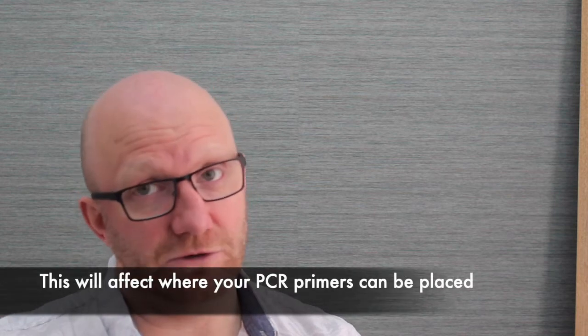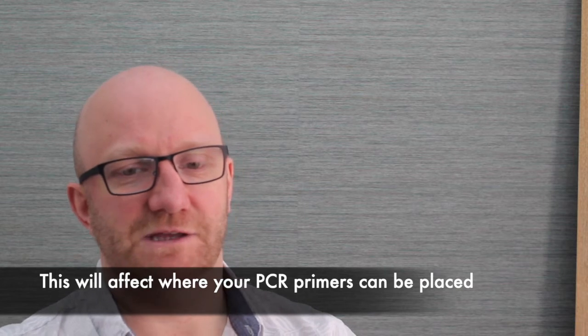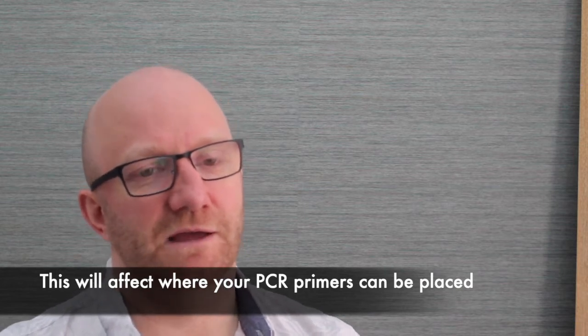Secondly, for long transcripts with complex secondary structure, your reverse transcription reaction might not efficiently convert the 5' end of your transcripts. So the 3' end should be good, but you might not get all the way through to the 5' end. And again, that means that you might artificially change the ratio of 3' end over the 5' end, which would again affect your interpretation.